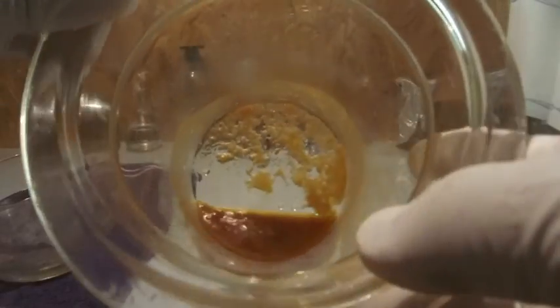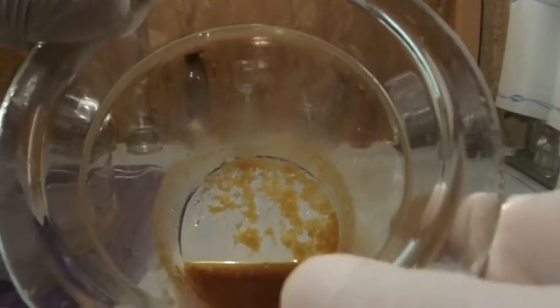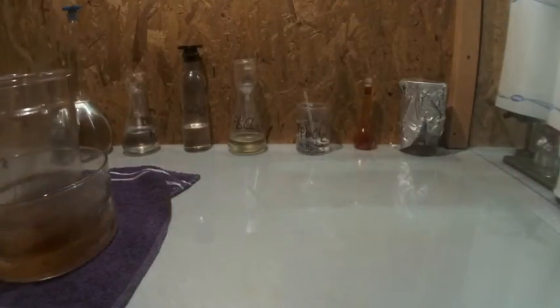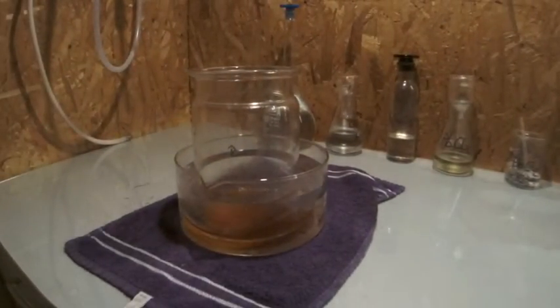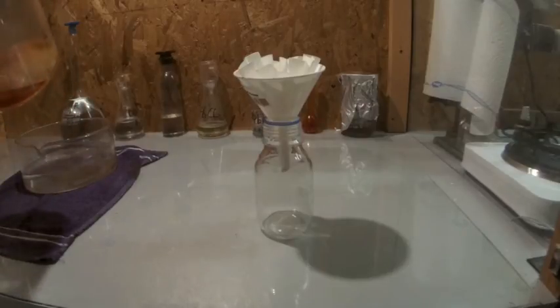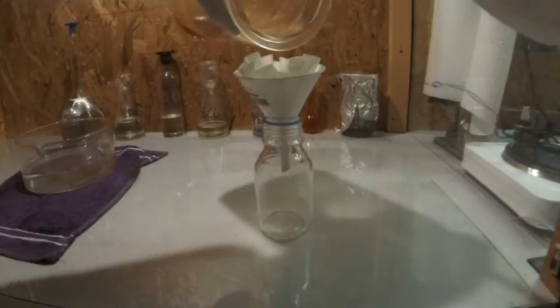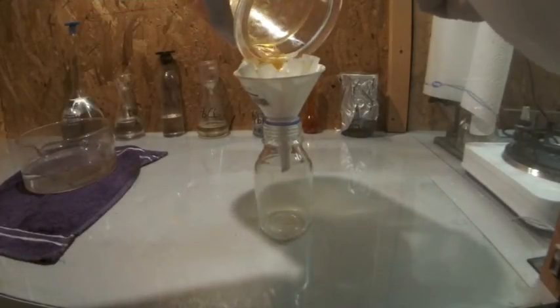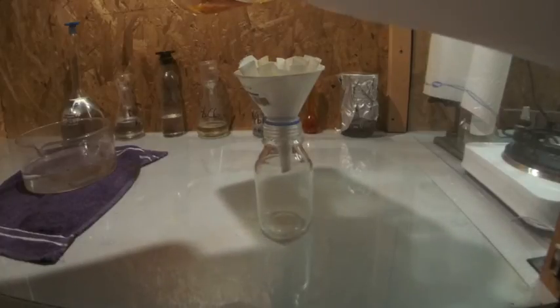I got a brownish looking product slush which I cooled in a water bath and then filtered. I washed my product with ice cold vodka because it gave the best results on cleaning the oxalic acid. In my case I did a gravity filtration because I was a bit lazy, but you could also do a vacuum filtration.